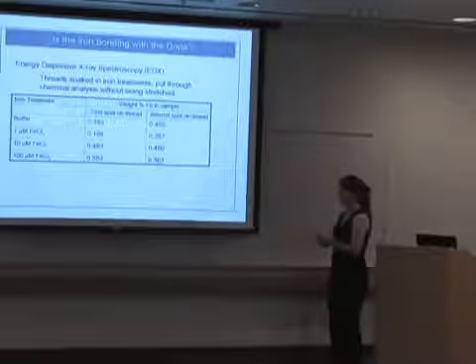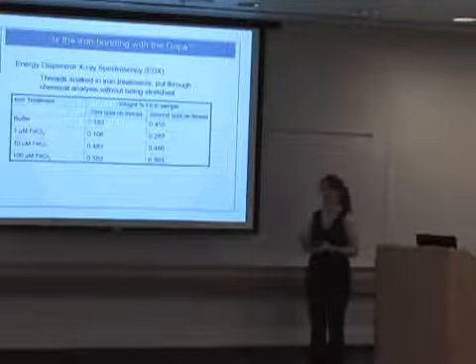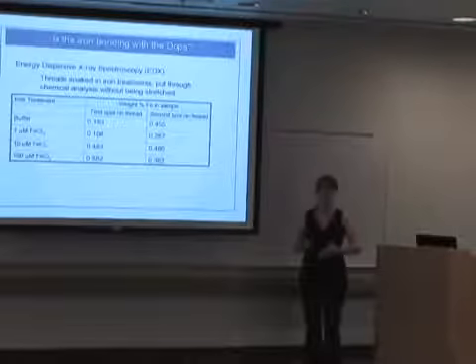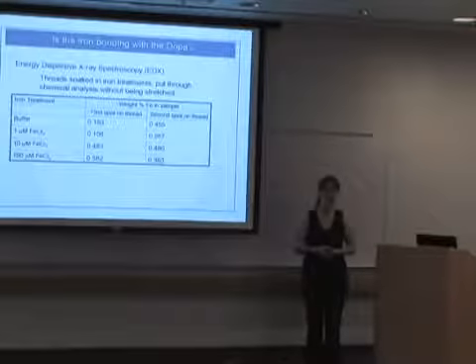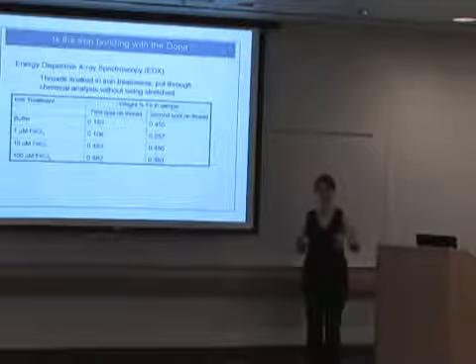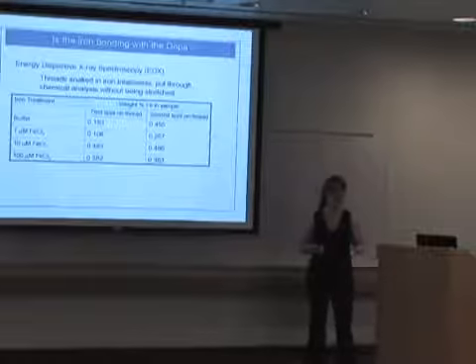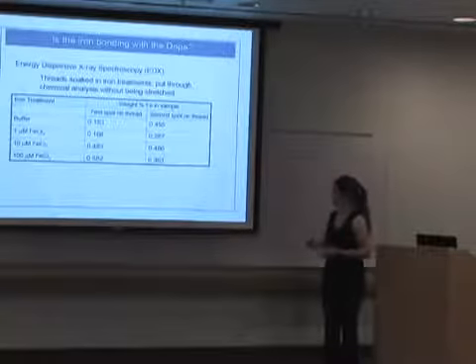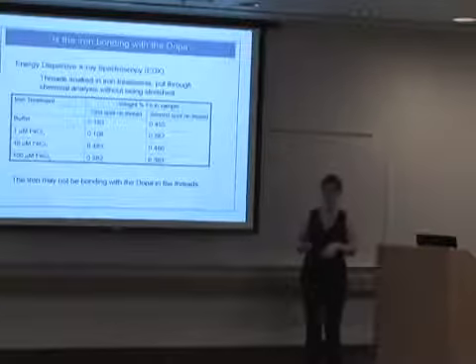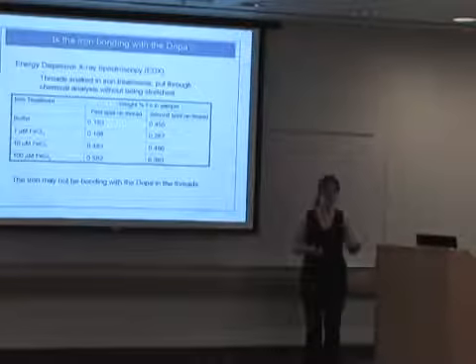And as you can see, the buffer, which is the control, showed 0.183 and 0.455 weight percent of iron, and then all the other treatments showed, while it's still increasing, not too different from the control. And with EDX as well, any weight percent below 1 weight percent, it starts to become questionable as to the accuracy of the reading. It's just such a small amount of iron. So essentially, the iron may not be bonding with the DOPA in my treatments, or if it is, it's at such a small level that it's deemed insignificant by the level of accuracy that EDX can give you.